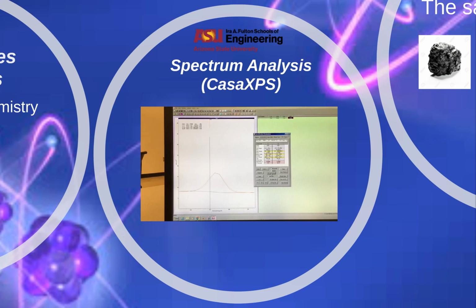For example purposes, we will only be analyzing the 30-second anneal test run. Click on the 30-second anneal folder, copy all of the documents by double-clicking and dragging or Ctrl+A, and click Open. We open the periodic table and choose the elements that were used in the sample, which are carbon, oxygen, copper, and silver.